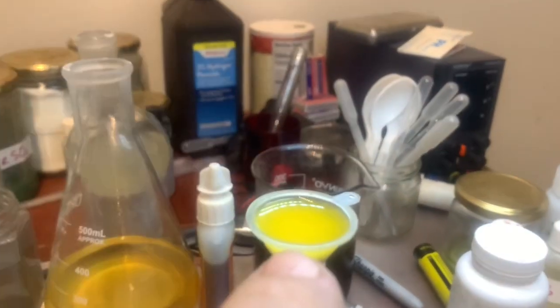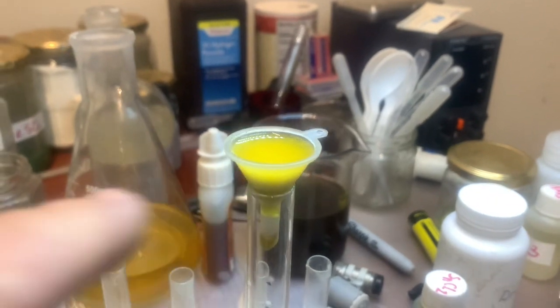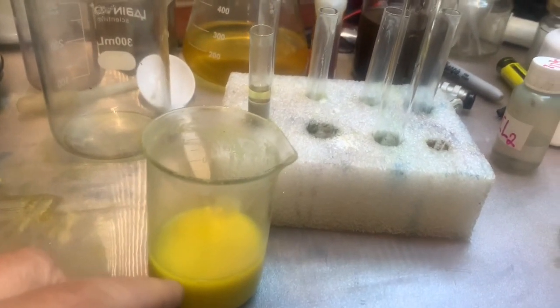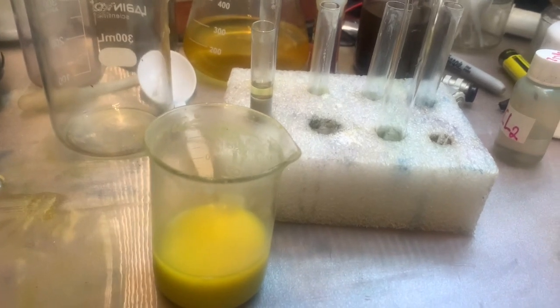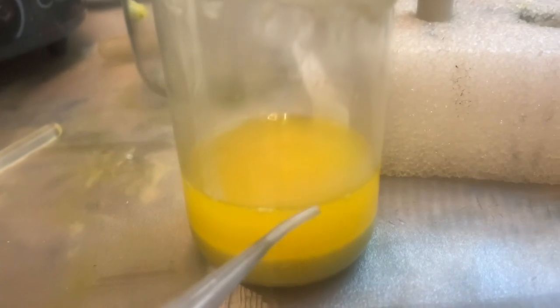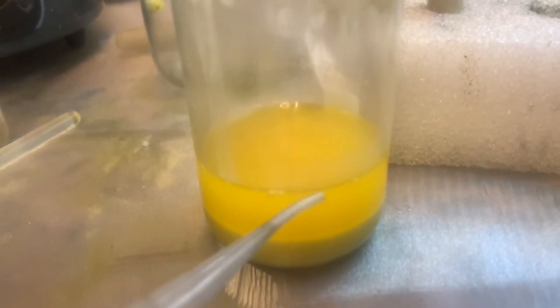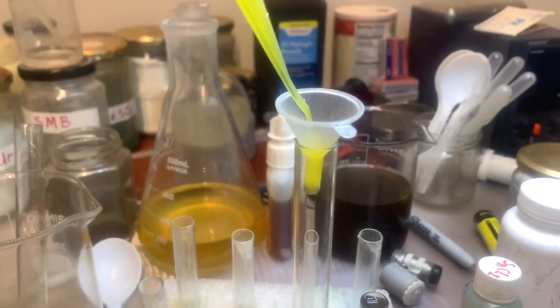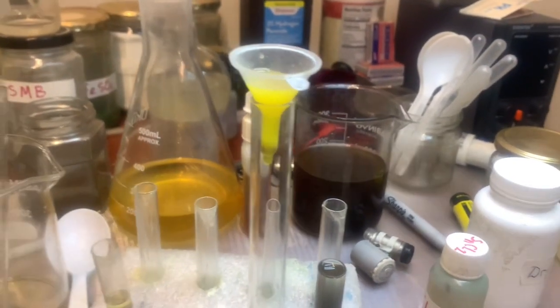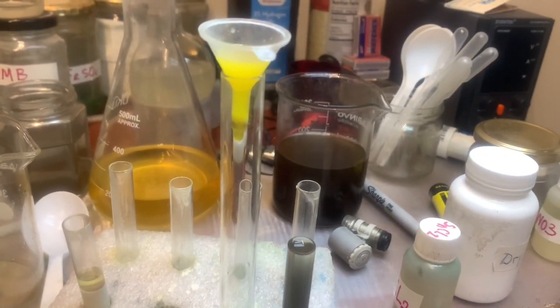Okay, because I see the surface is settling down. So we can put in the tall beaker and wait till everything finishes. See, after a while, all settled down, that silver chloride in the bottom. And this juice, now I can start filtrating. That'd be less problems. I change the filter, and now I'll be filtrating this material.